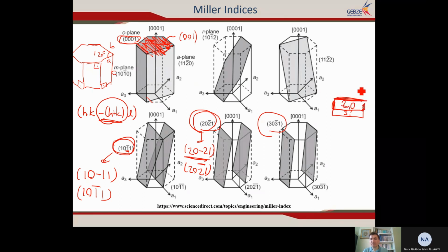You can check whether zinc oxide structures are grown like this on the surface of the silicon, or whether they are grown like this. So this surface is something else, and this surface is something else. So zinc oxide can grow on this substrate with different surfaces. By using X-ray diffraction, you can determine this. This is very useful for determination of Miller indices in crystal structures, in thin film applications.